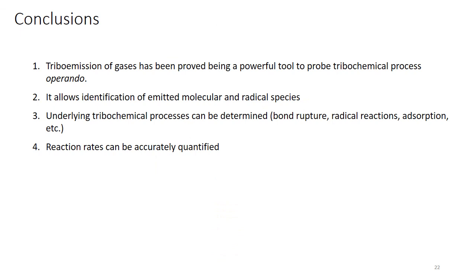And finally I come to the conclusions. First, triboemission of gases has been proved to be a powerful tool to probe tribochemical processes in situ and in operando. So you can obtain information during the experiment, or even in the real system if you have some measuring devices to measure the emission of gases. The gas triboemission allows identification of emitted molecular and radical species. This is very important and very different from other conventional techniques.